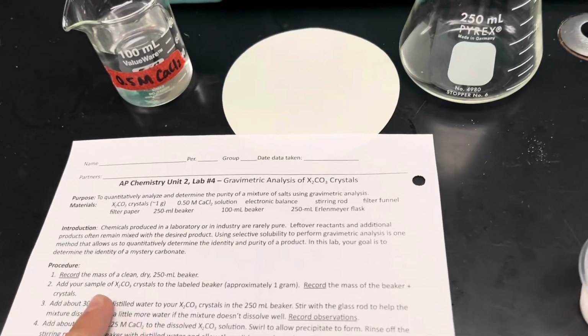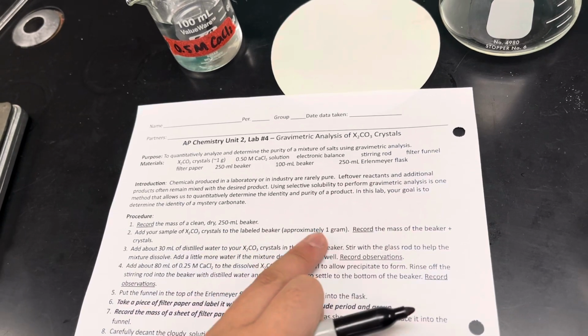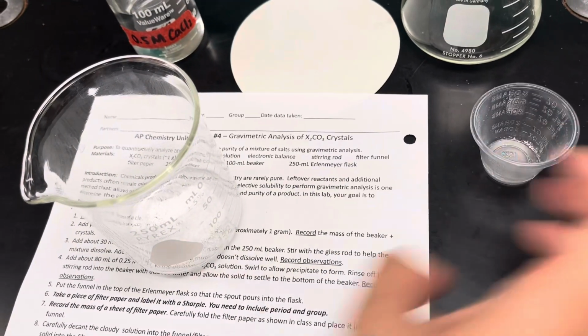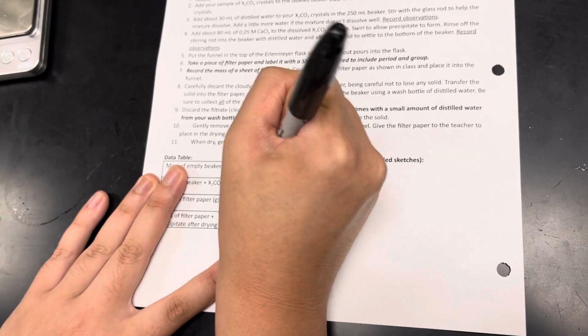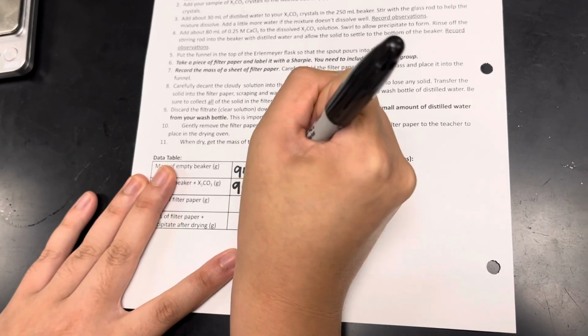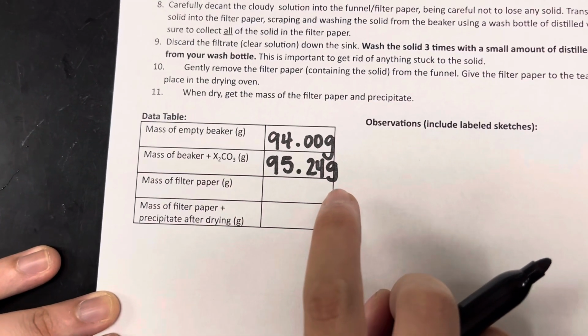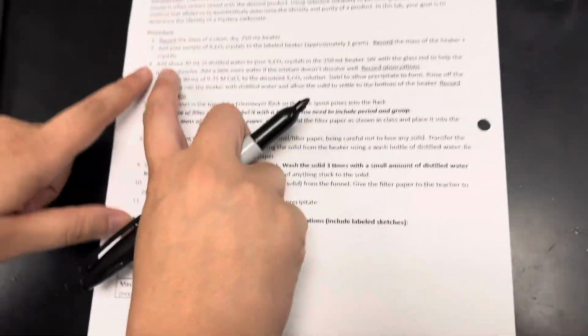And then step 2, we're going to add our sample of X2CO3 crystals to the labeled beaker. It's going to be about 1 gram. So let's go ahead and add our crystals to the beaker. And we're going to weigh this one again. So let's get the mass again. And this one is going to be 95.24 grams. So you should be able to tell how much the crystals themselves weighed, right? Because there's the beaker and then there's the beaker with the crystals. All right, let's go ahead to number 3.